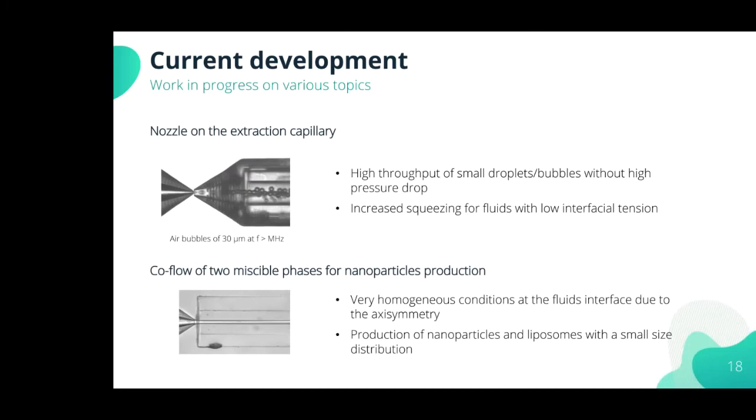When you polymerize the polymer drops, how do you control the UV light energy? Will the UV light polymerize the middle phase material? Okay, actually the polymerization using UV light just initiates polymerization because we add a photoinitiator in the resin. So the cross-linking will continue after the UV light is switched off. We initiate the polymerization in the tube. We get a hard material, so we don't have any more coalescence, but the cross-linking continues in the collection reservoir.